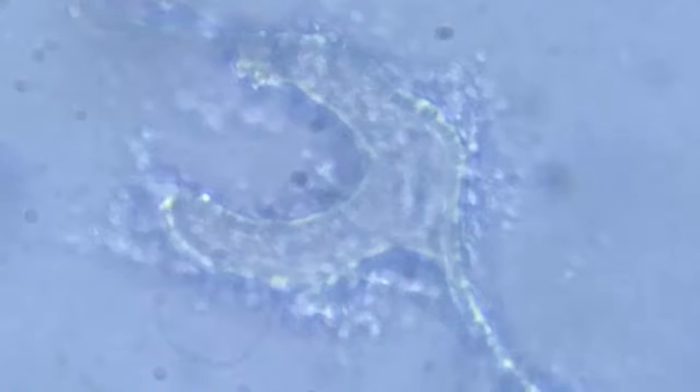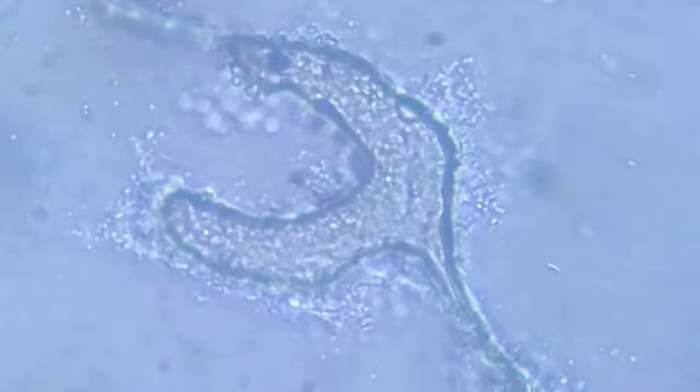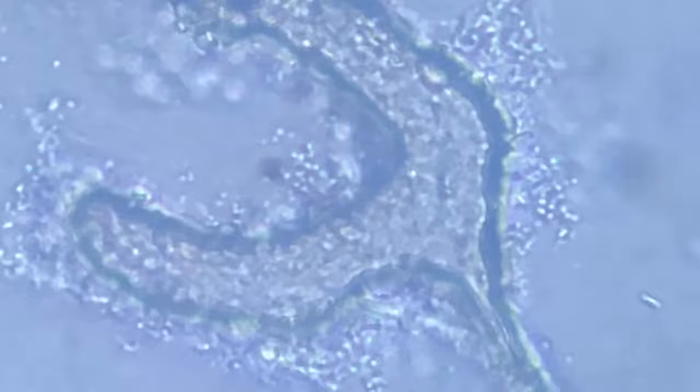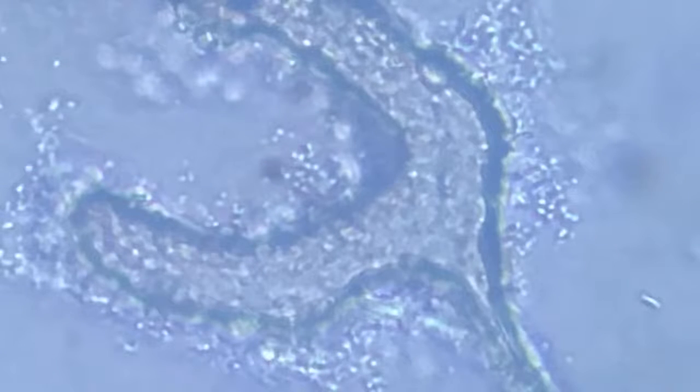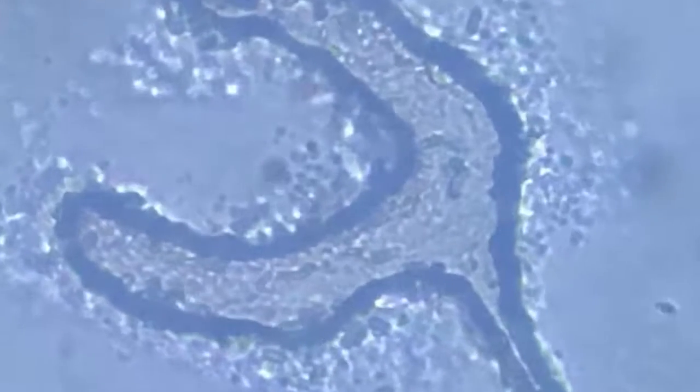This greenishness is because of the refraction and at the same time also the representation of the chlorophyll content within those food elements that they had consumed. That's it for them.